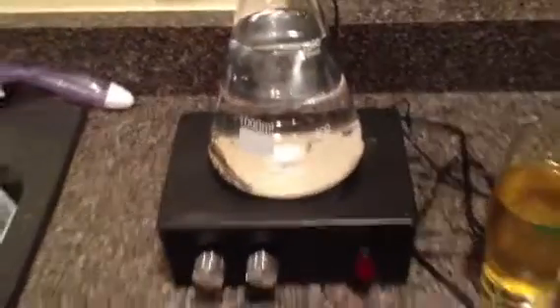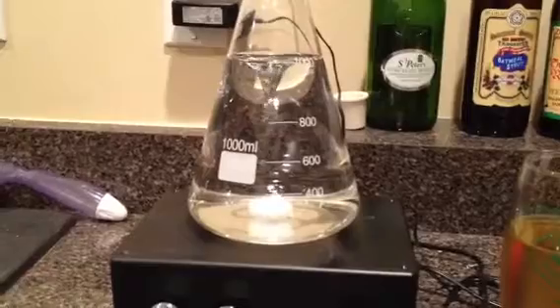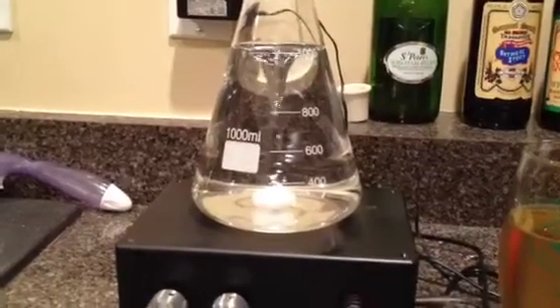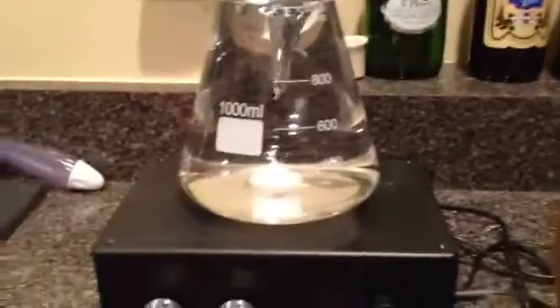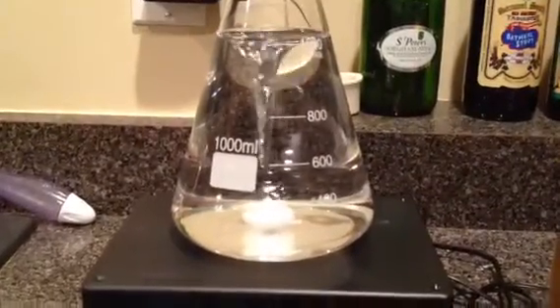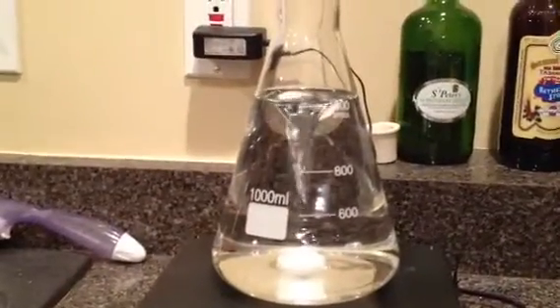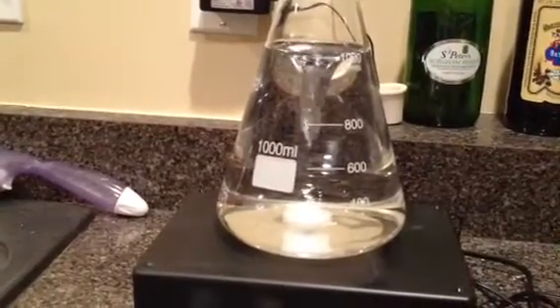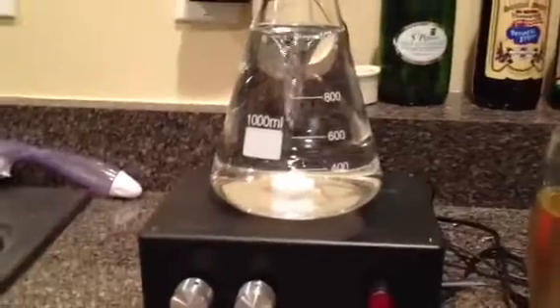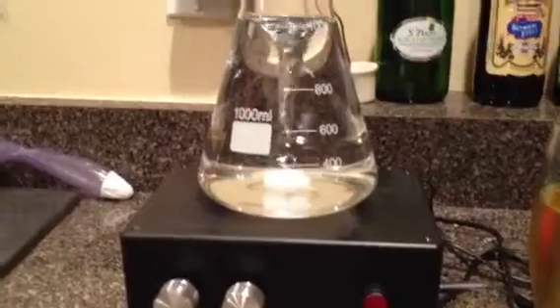Just to see what we're getting here — I have this 1000ml flask that I picked up from a brewing supply company. You can get them online fairly cheap too if you don't have one near you. Basically what this does is there's a magnetic stir bar inside the flask right now. I got this one from McMasterCar.com — this one's a 1 inch. I got a 5/8 inch stir bar as well, but the 1 inch seems to do a much better job stirring up and keeping a constant whirlpool in there.